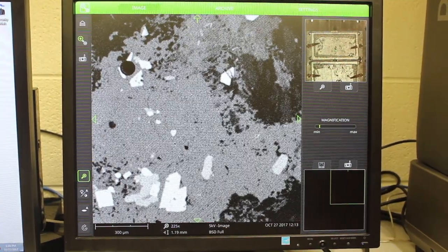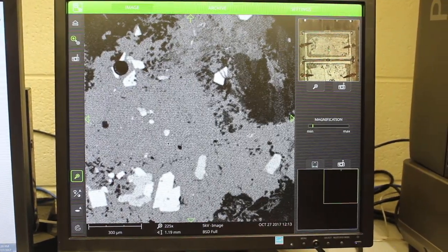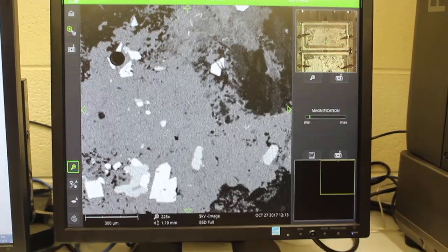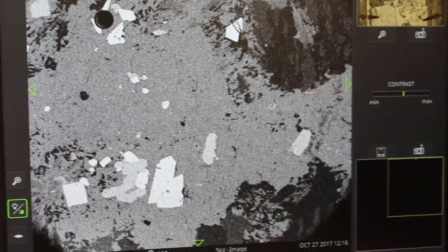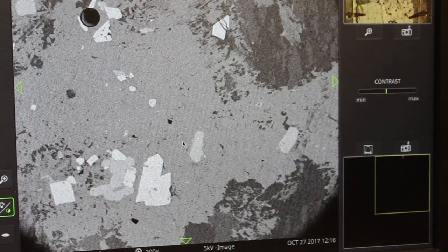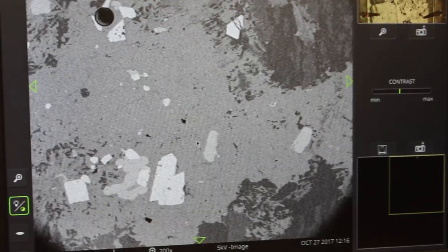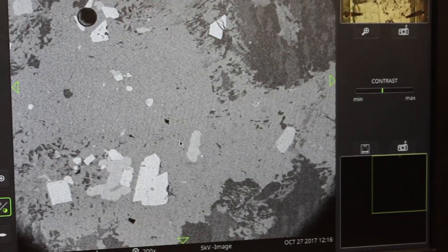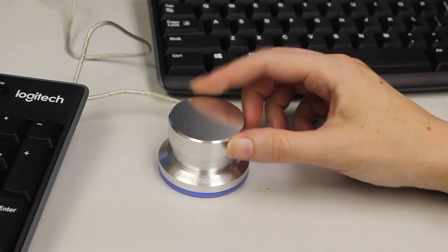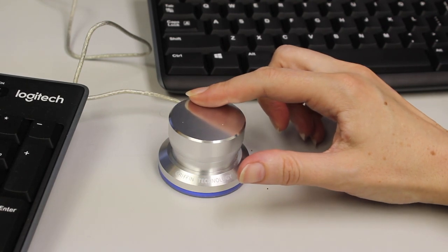You should keep adjusting these different things until your image looks good. Going back to the brightness contrast button, we've changed it to manual and we're changing the contrast so that the image looks better and so you can see textures better. The fine scroll wheel on the mouse, which you can rotate back and forth, is another way to adjust these things.